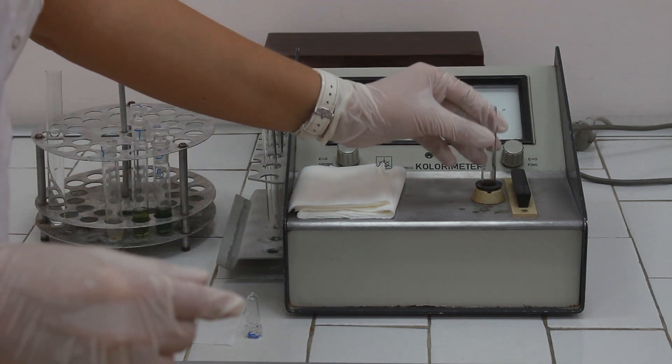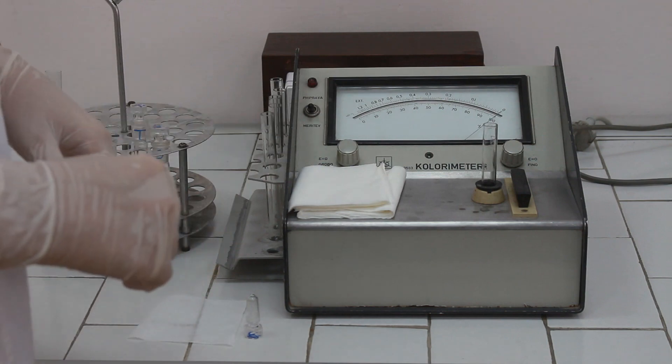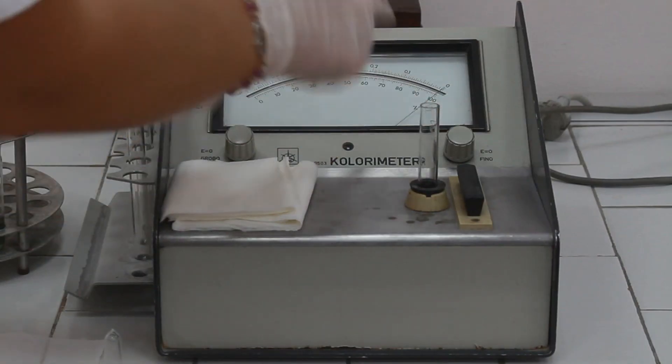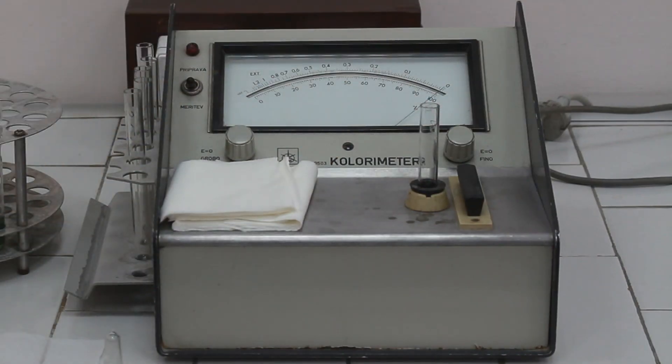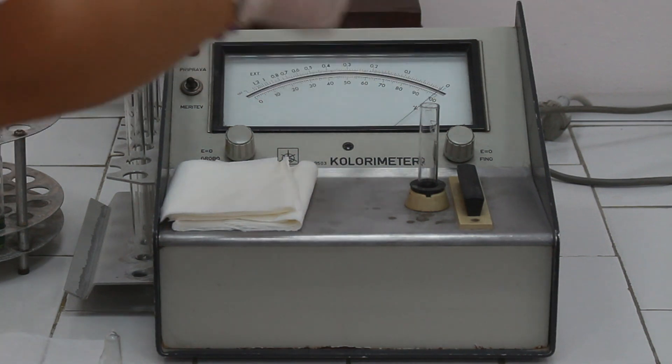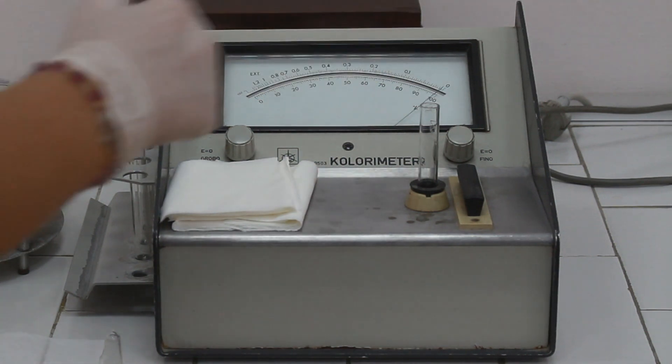And place the cuvette to the photometer. By using these two wheels, we have to adjust the instrument to zero. Left wheel for the rough adjustments and right wheel for the fine adjustments of the zero.